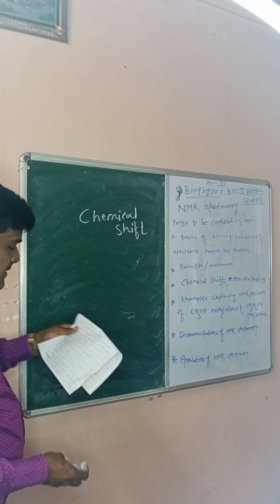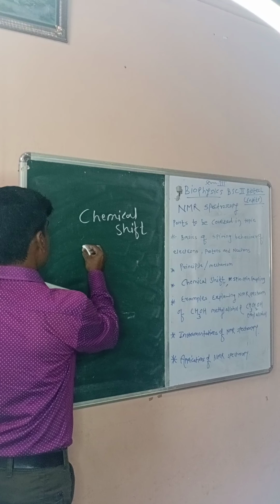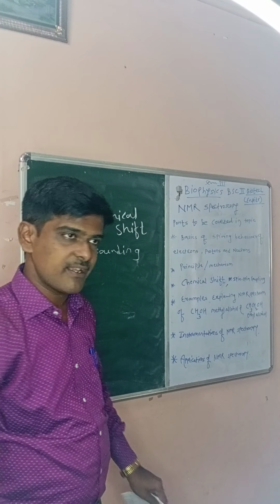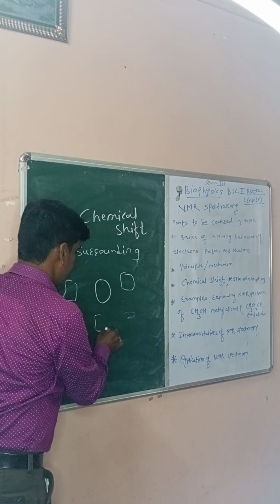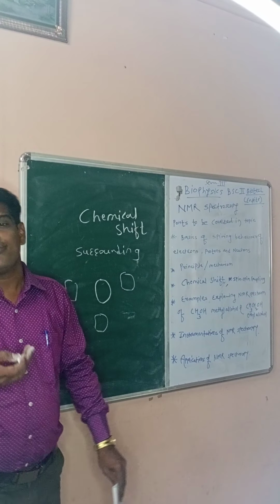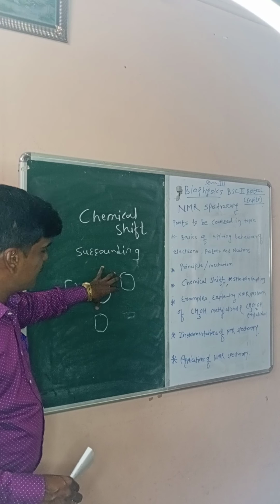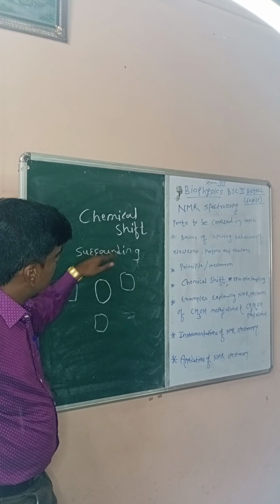So in chemical shift, the nuclei of an element give distinct spectral lines depending upon their surrounding nuclear environment. Whatever molecule we study by NMR spectra, surrounding it there are different molecules, biomolecules or chemicals present, which are responsible either for attracting the protons from the nucleus or for shielding or masking the protons of the structure whose spectra we are going to determine.